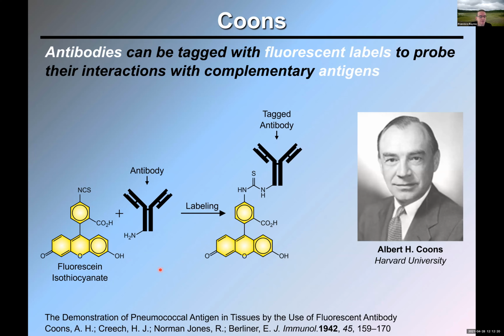And of course, the approach is not limited to fluorescein. Today, we have hundreds of different synthetic fluorophores that are specifically designed for this type of labeling strategy. If you go through the Sigma Aldrich catalog, for example, you'll find plenty of examples with all kinds of fluorophores, fluoresceins, rhodamines, BODIPYs, coumarins, that have reactive functional groups that can be used for this type of process.